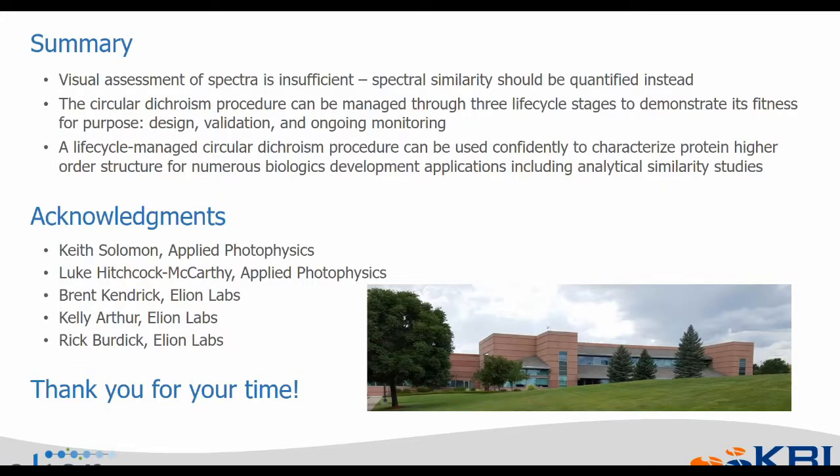All right, and with that, I'll summarize a few of the key points from the webinar. First of all, I hope I was able to describe why visual assessment of spectra is insufficient. And I don't mean to say that we shouldn't look at the spectra. Of course we should. But when it comes to a determination of similarity, it's important that we also have a way of reducing that spectral output into a number that demonstrates the degree of similarity between those two spectra.